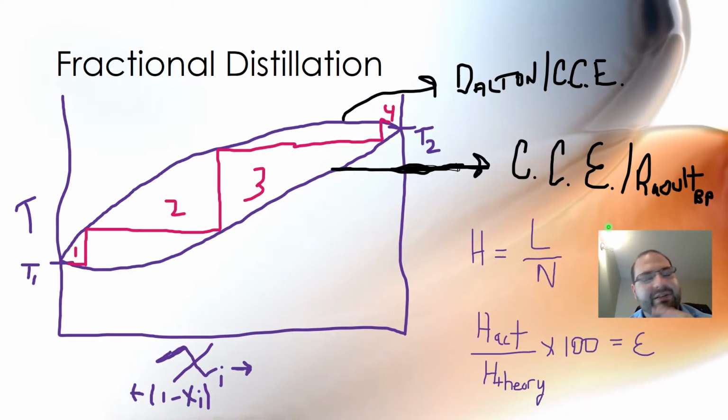And there's really two different ways you can look at a theoretical plate. You can look at it based on the plate height, which is given by the equations I have down here, or you can look at them visually by looking at a boundary for the boiling point of the two components being mixed together at given mole fractions and temperatures. And then you can look at the vapor temperature in relationship to the mole fractions. And those two separate graphs make a lower and an upper boundary, and between those two you have this space where the theoretical plates exist.